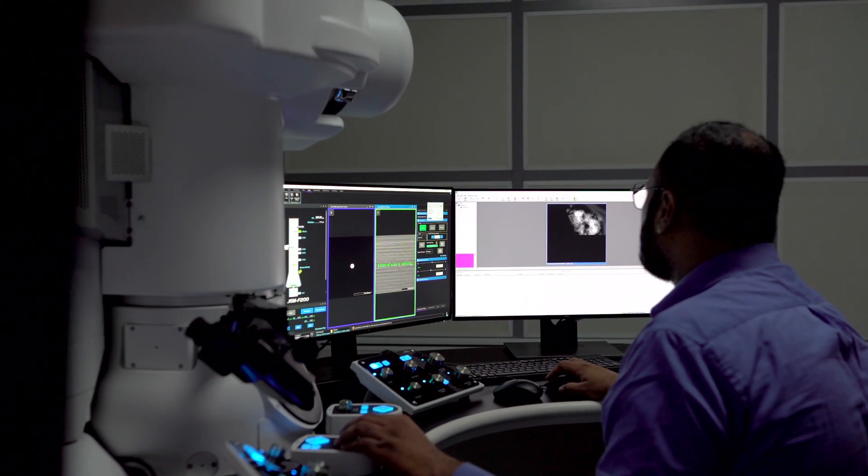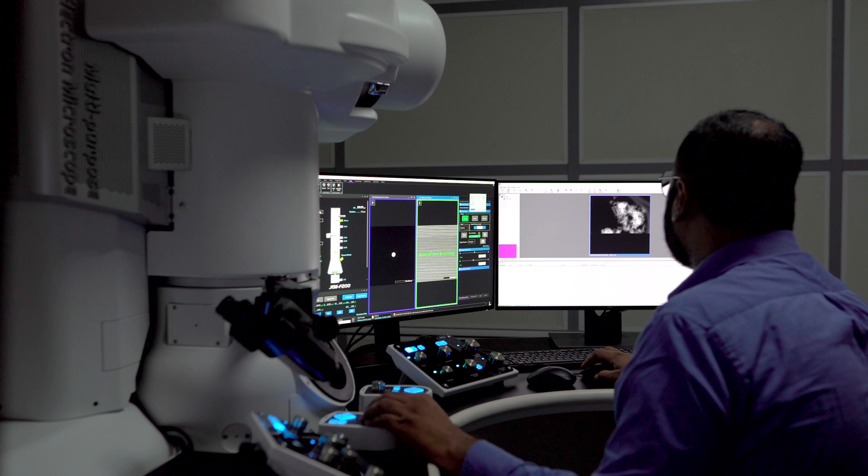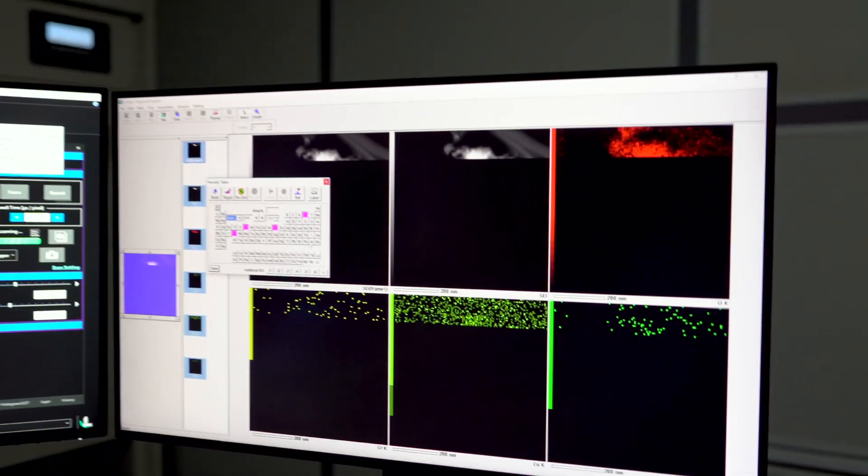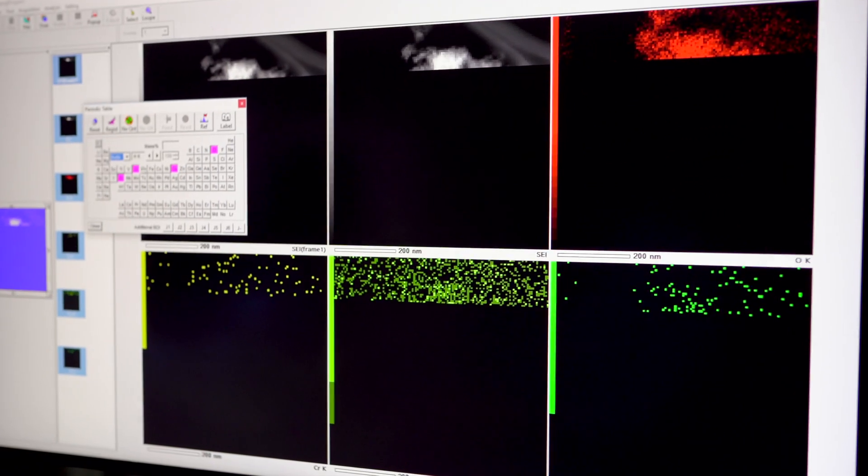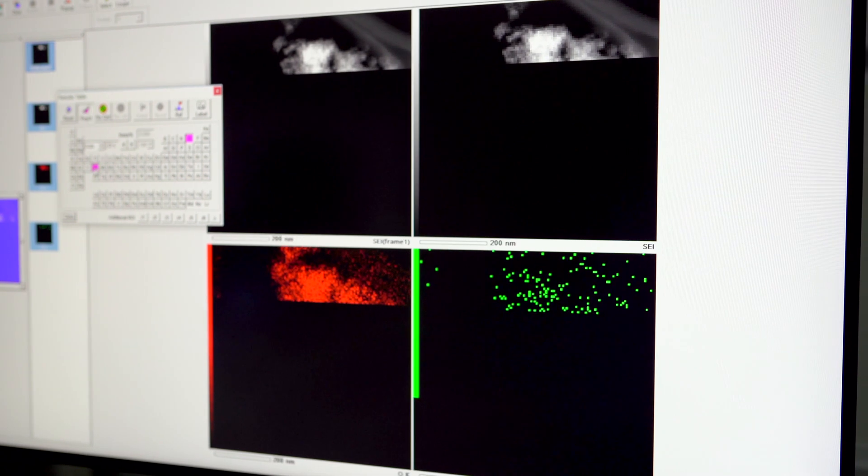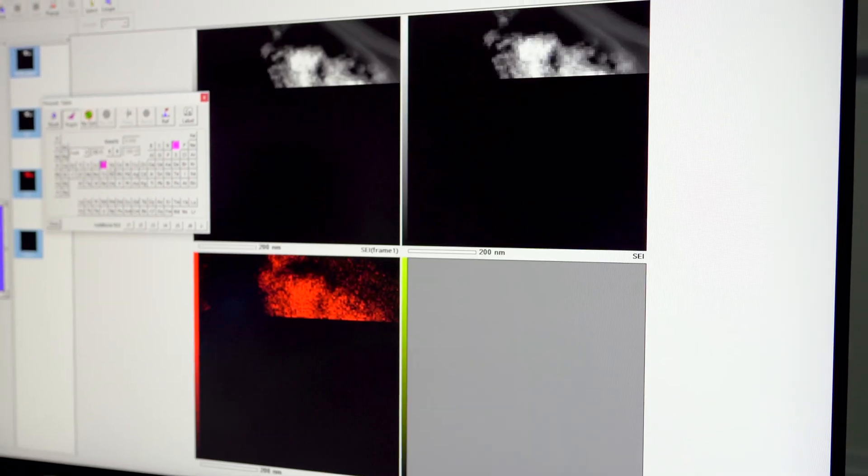When you do that you can actually correlate with each pixel what is the composition associated with the material and then you can get a compositional map. So you get structural and compositional information about your sample by using the transmission electron microscope.